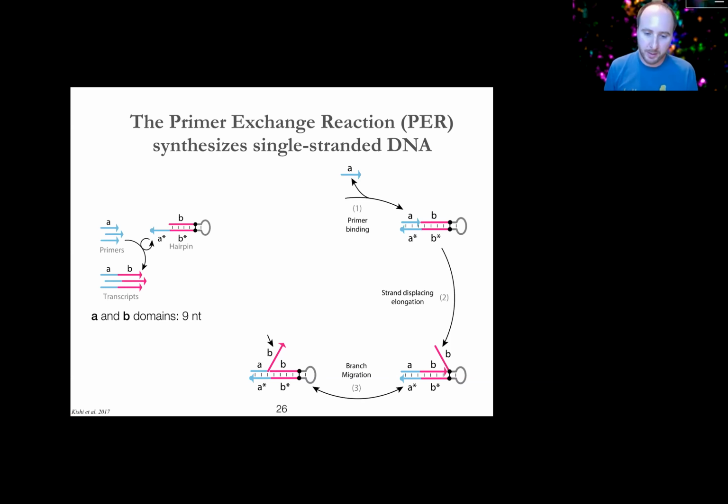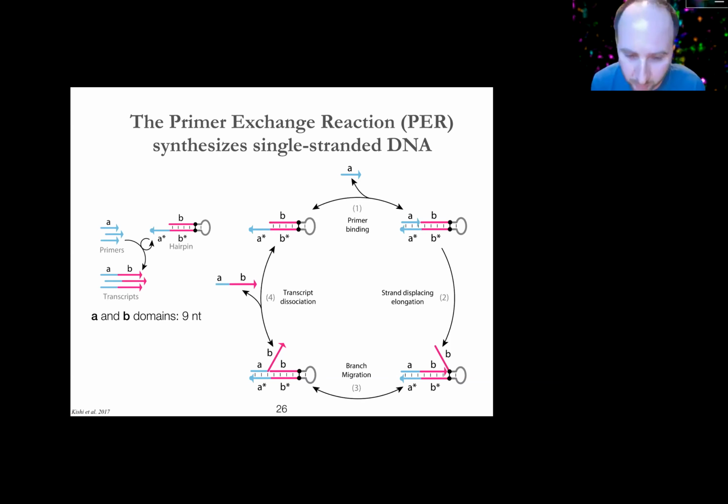Because similar to DNA paint, we can program the kinetics and thermodynamics of these interactions. We deliberately make the A A star pairing quite transient. So just by spontaneous dissociation, this AB chimera that we've just made will just diffuse right off and float away. We've done one synthesis cycle at this point. So the B hairpin's free to initiate another synthesis cycle somewhere else, and we've now added the B domain onto A. Okay, so that's a PER reaction.